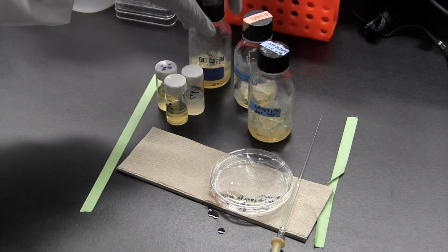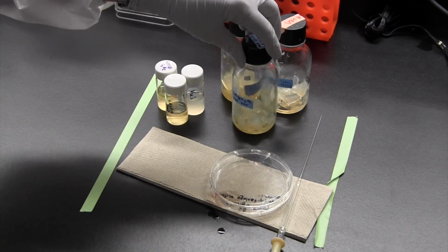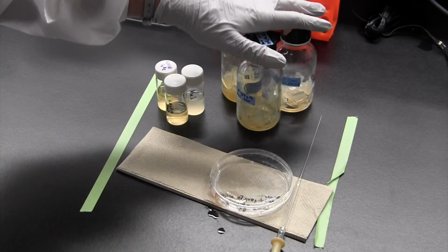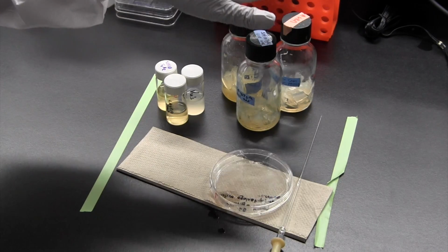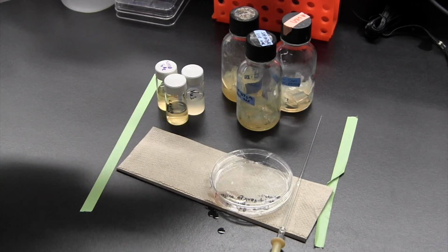Once that is done, you want to take anything that you want to reuse, such as these glass bottles, you would want to autoclave, and then that agar will get disposed in biohaz, and then you would clean and autoclave and reuse the glasses as needed.